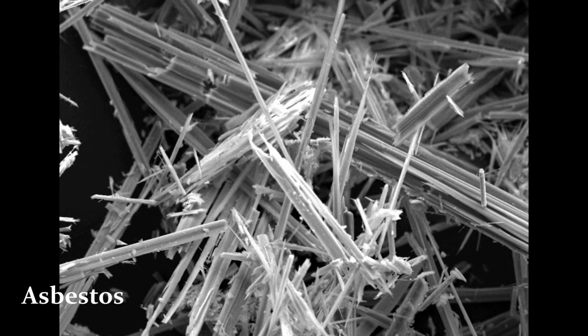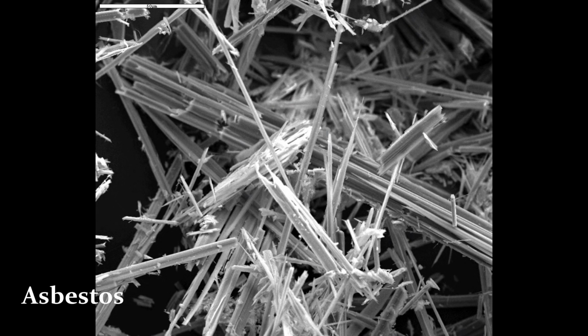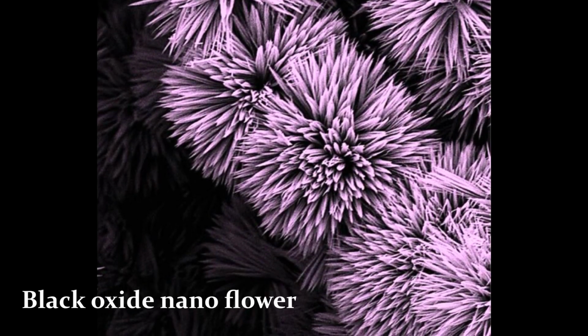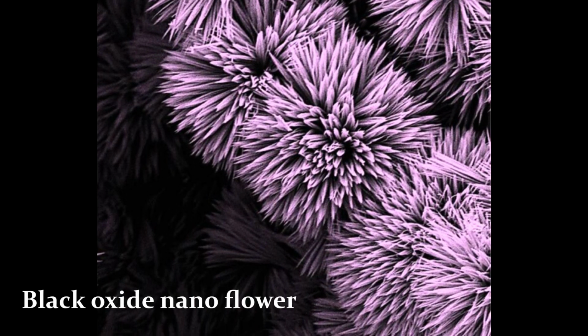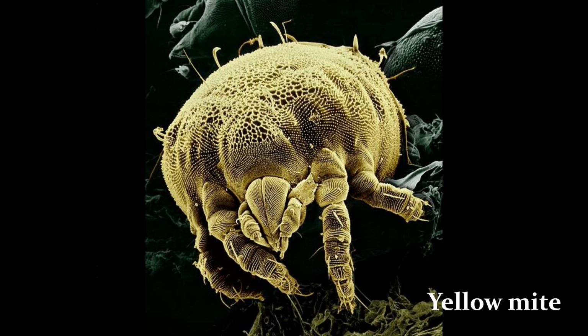However, the main advantage, and I repeat it again, will be the limits of the wavelengths we can record. The electron wavelengths are much finer than for the light beam, and it's on a finer spectrum of our wavelength spectrum, the waves that we cannot detect with our eye. Therefore, with developing computers and physics, we could now use these microscopes.